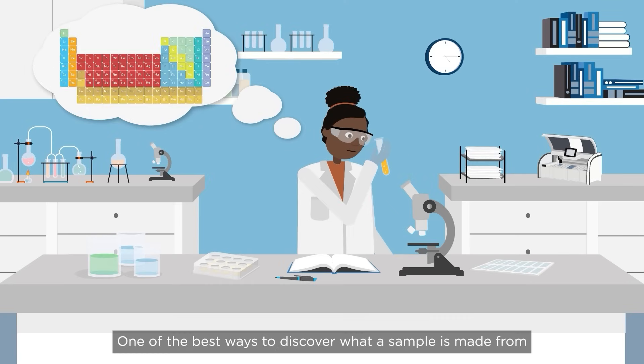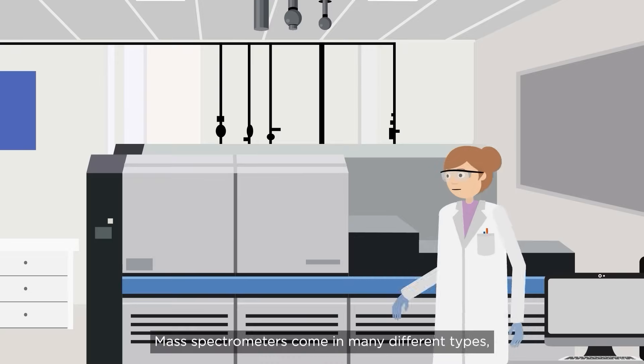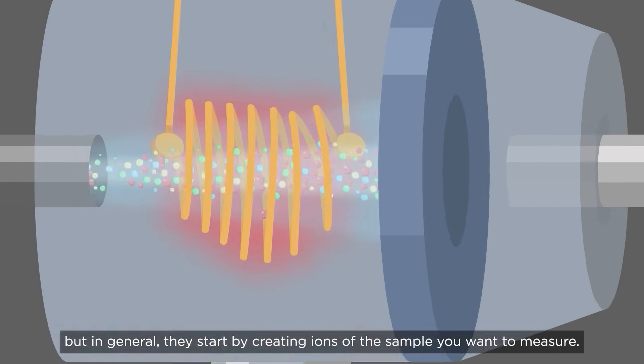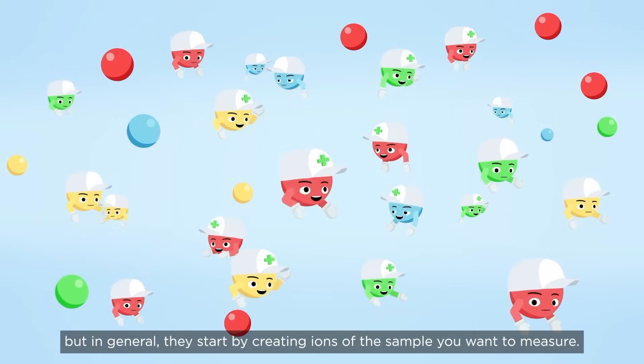One of the best ways to discover what a sample is made from is to use a device known as a mass spectrometer. Mass spectrometers come in many different types, but in general they start by creating ions of the sample you want to measure.